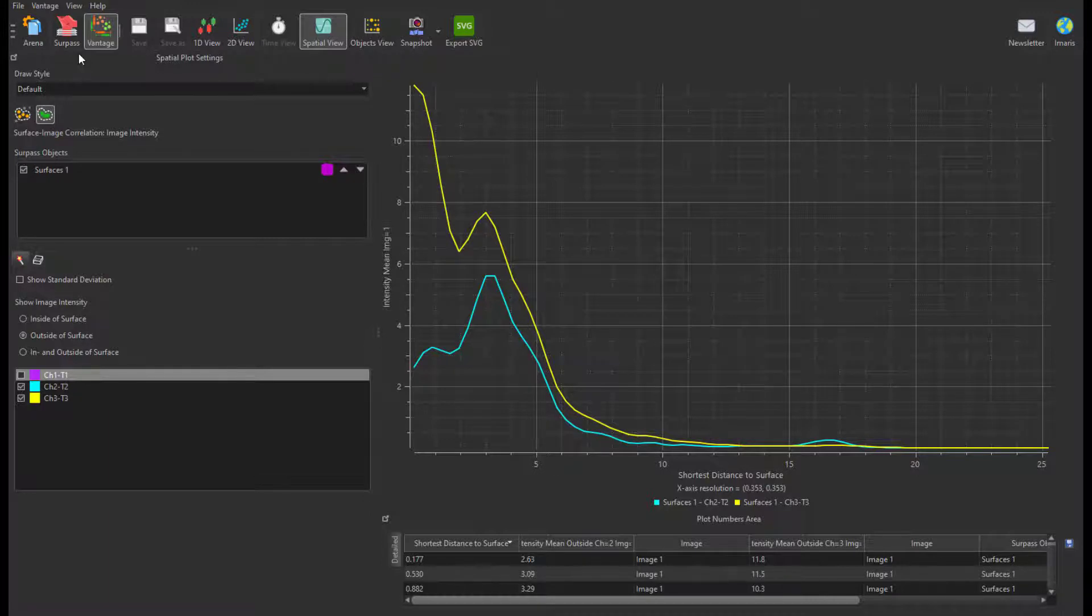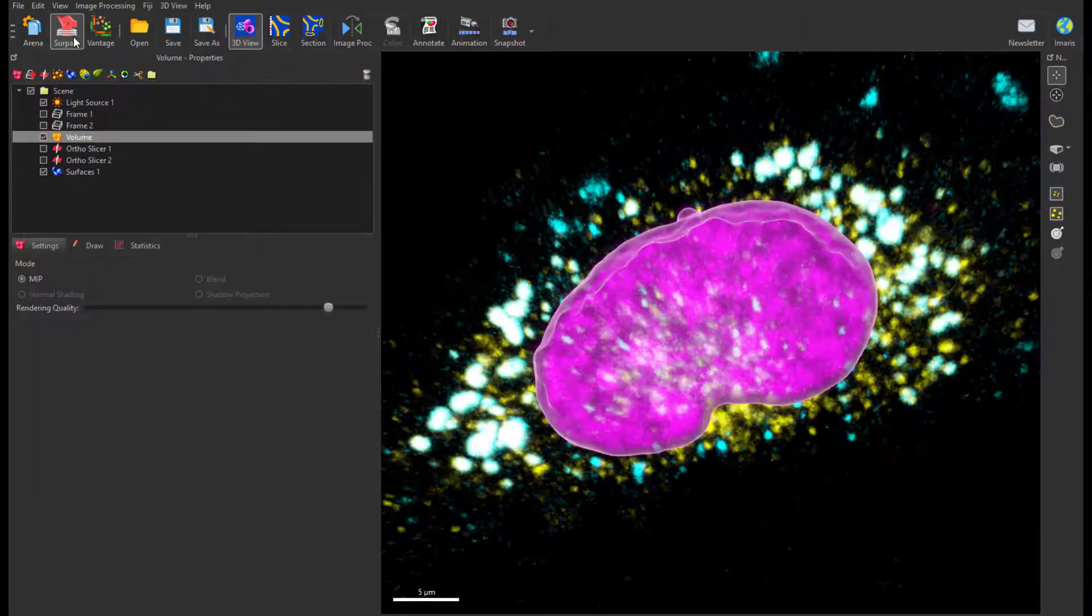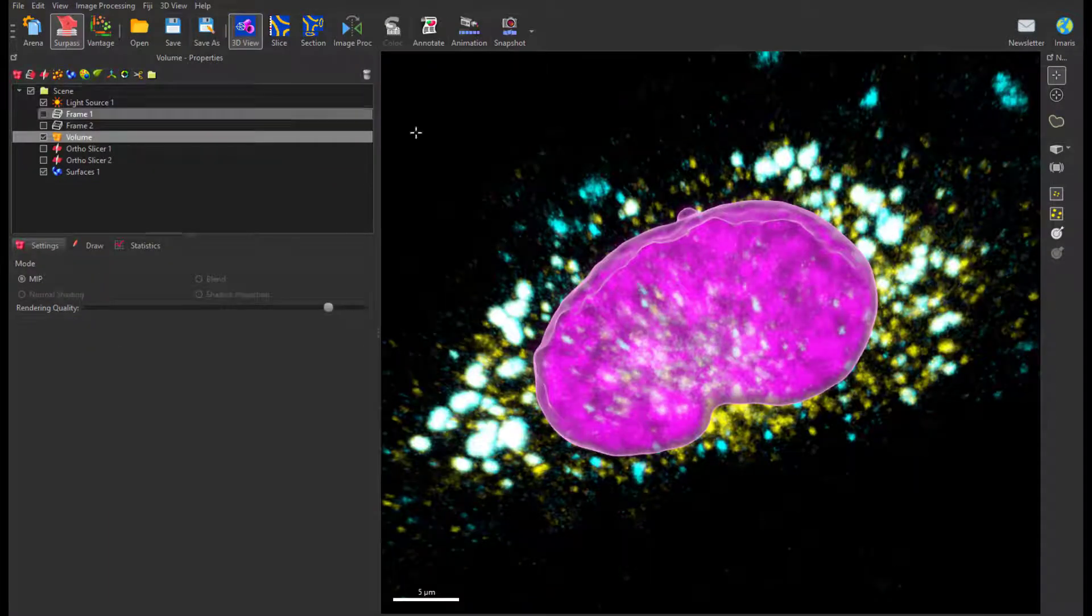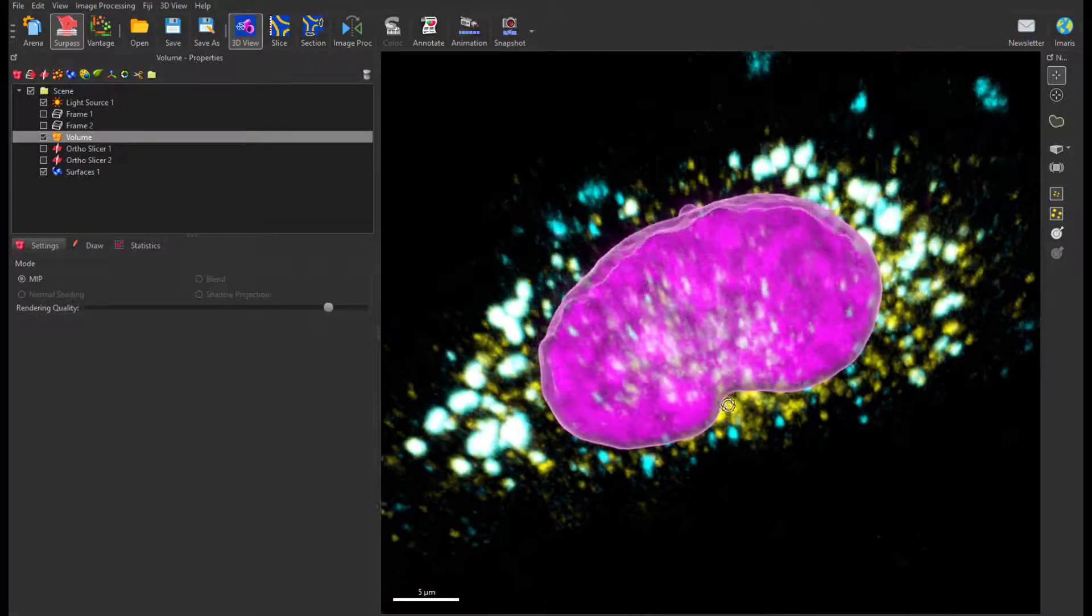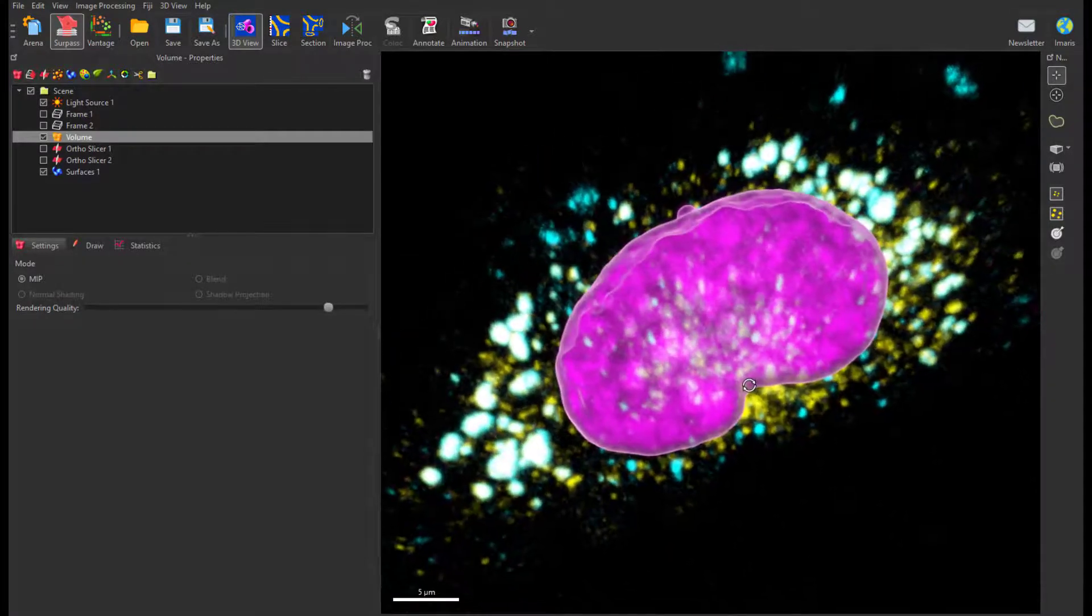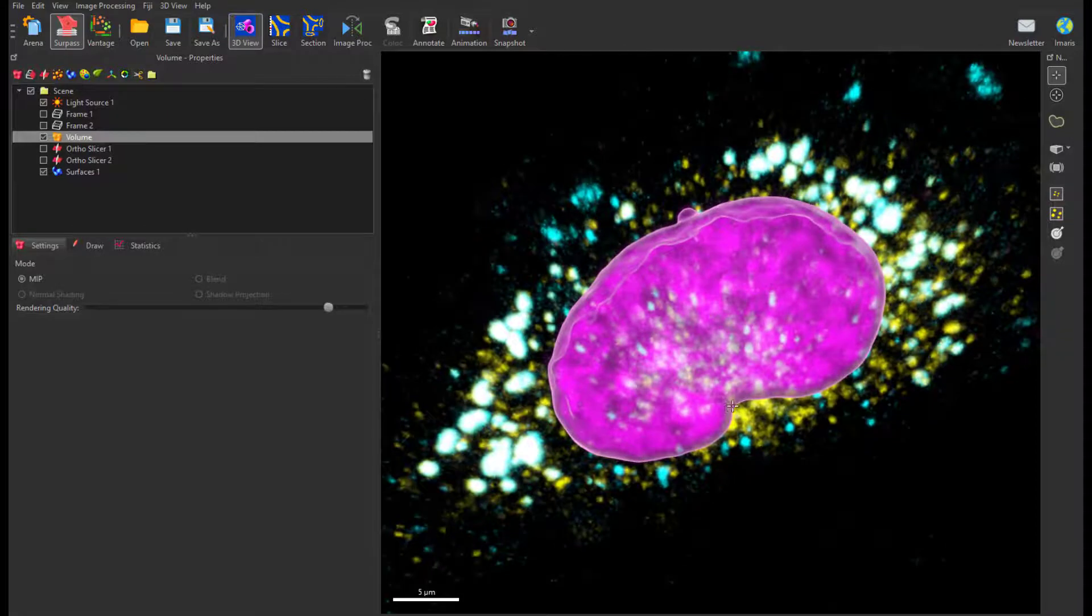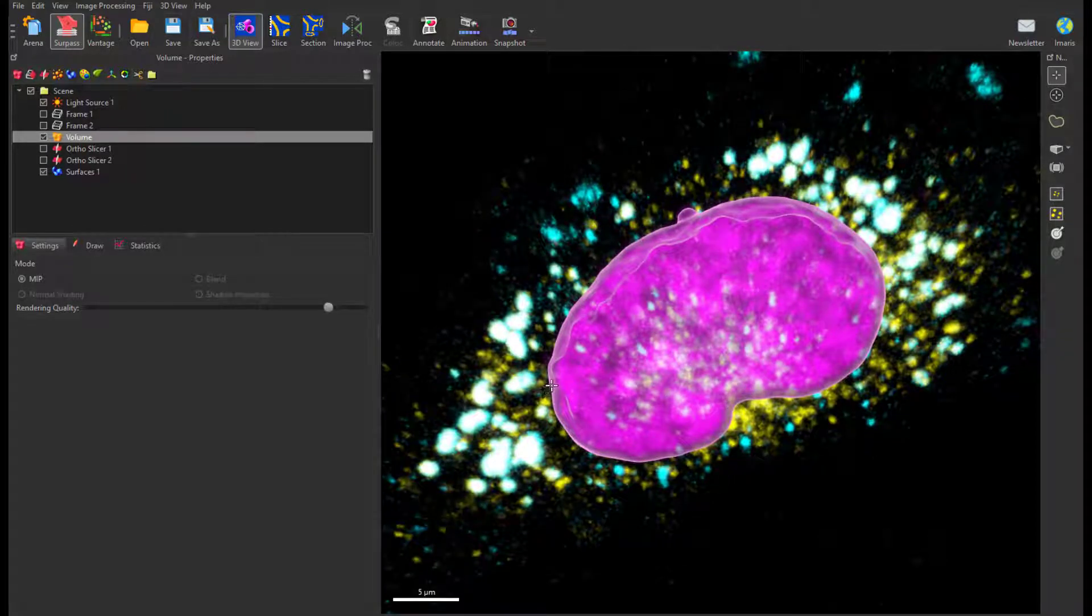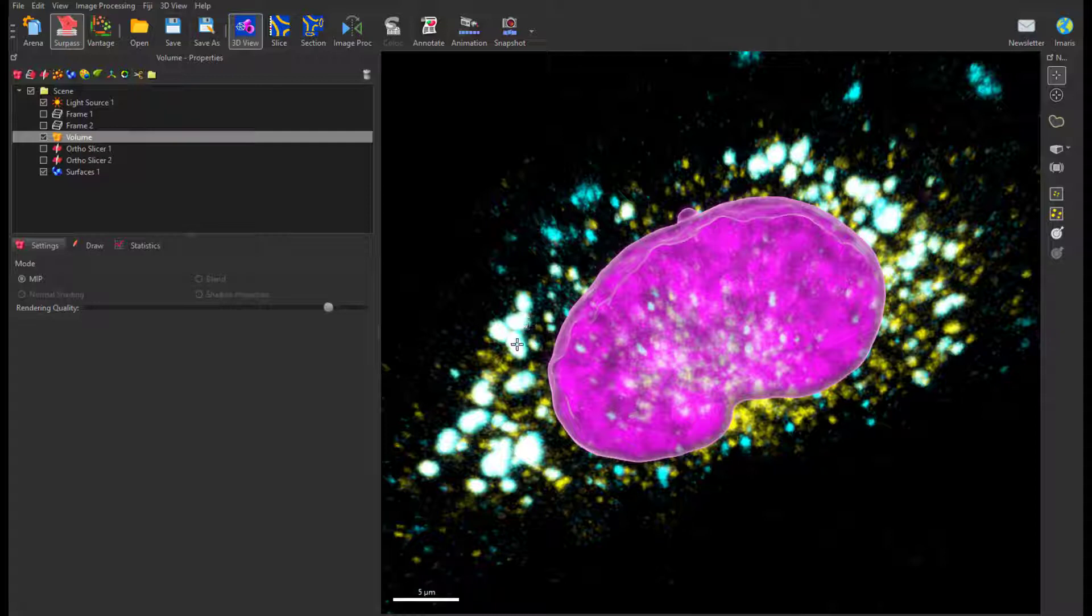Let's go back to the image in the surface view. Here, the surface around the cell nucleus in magenta was created. The surface rendering was made semi-transparent. There are two other channels: cyan and yellow.